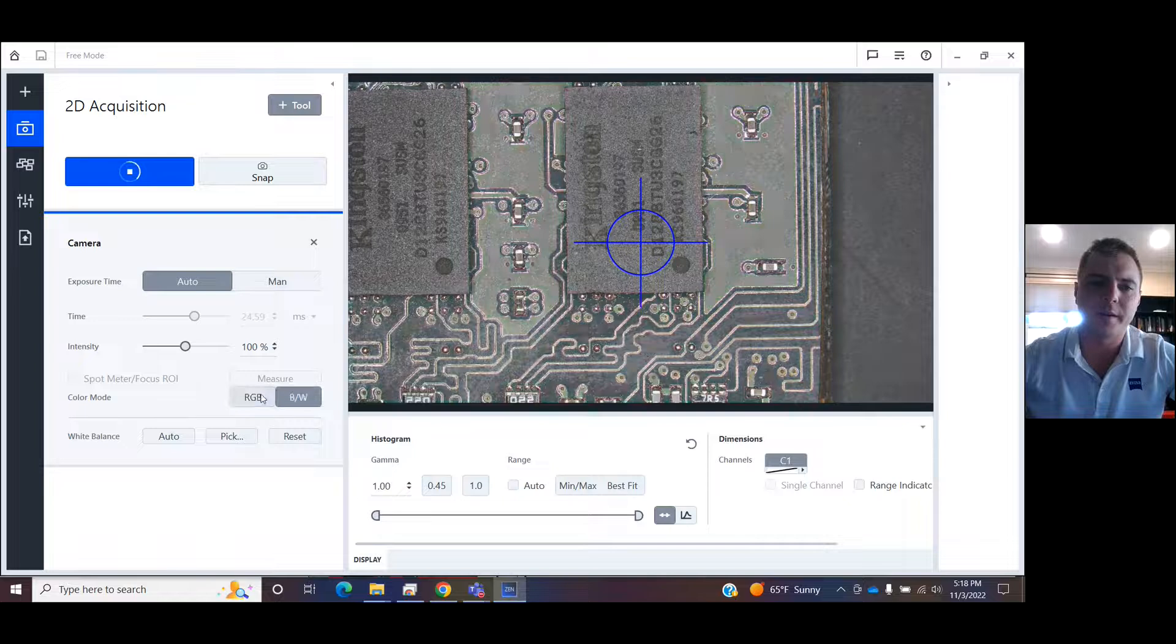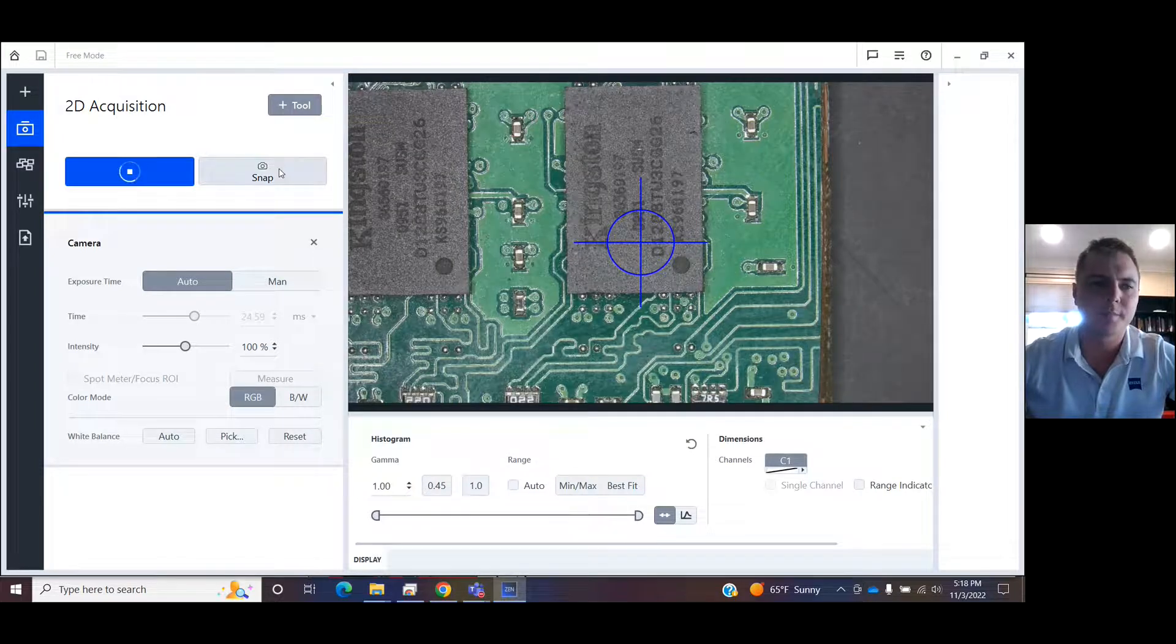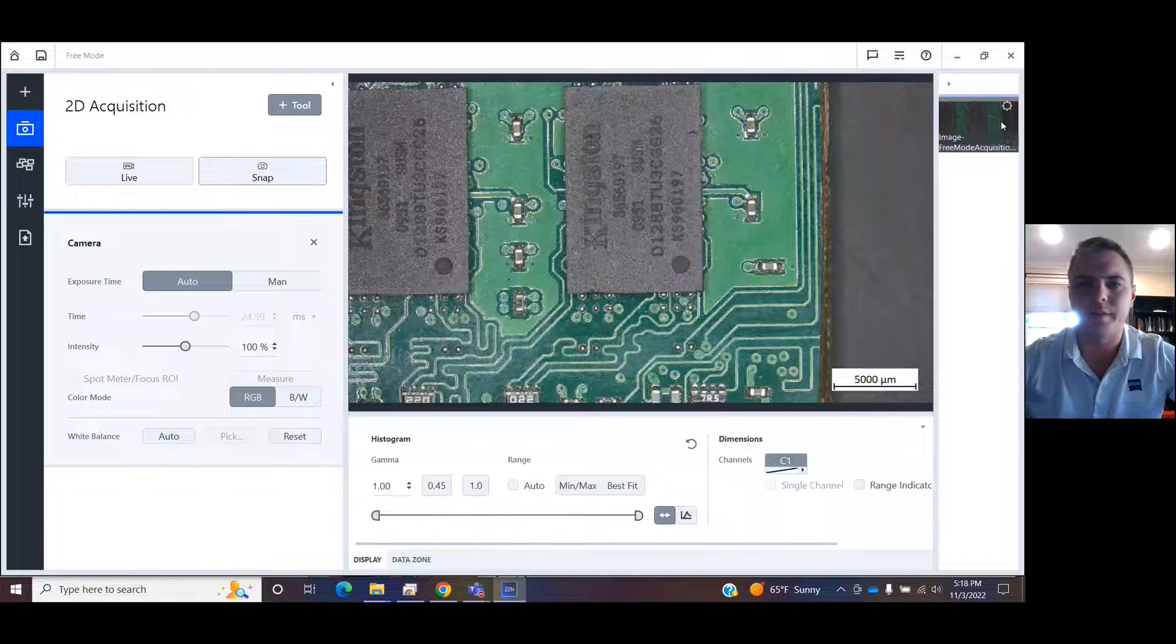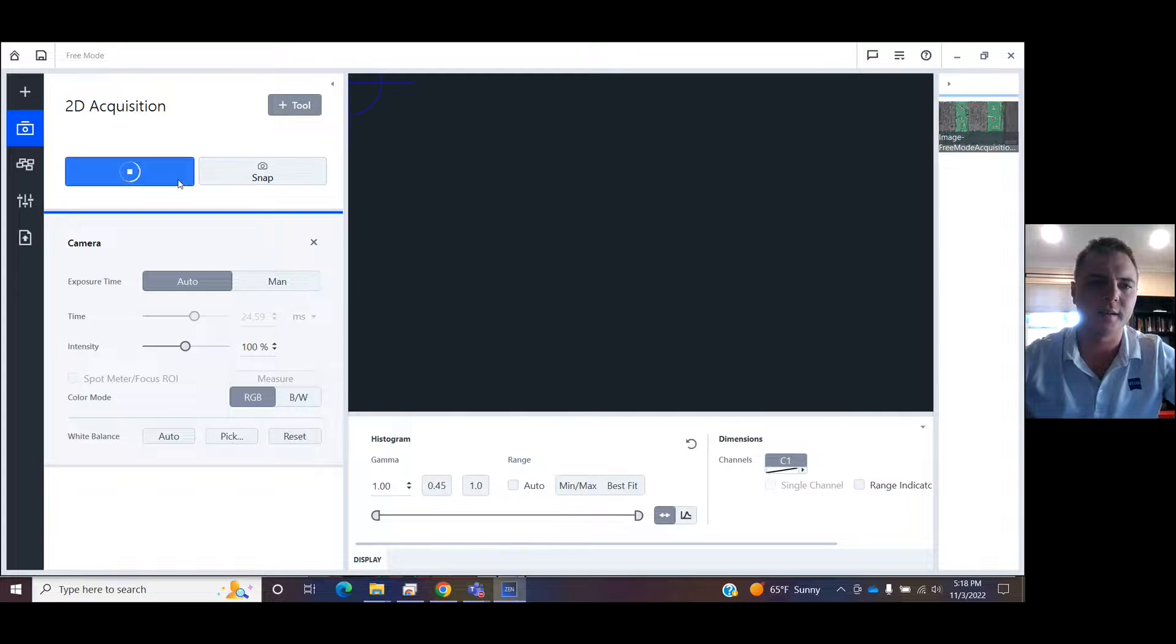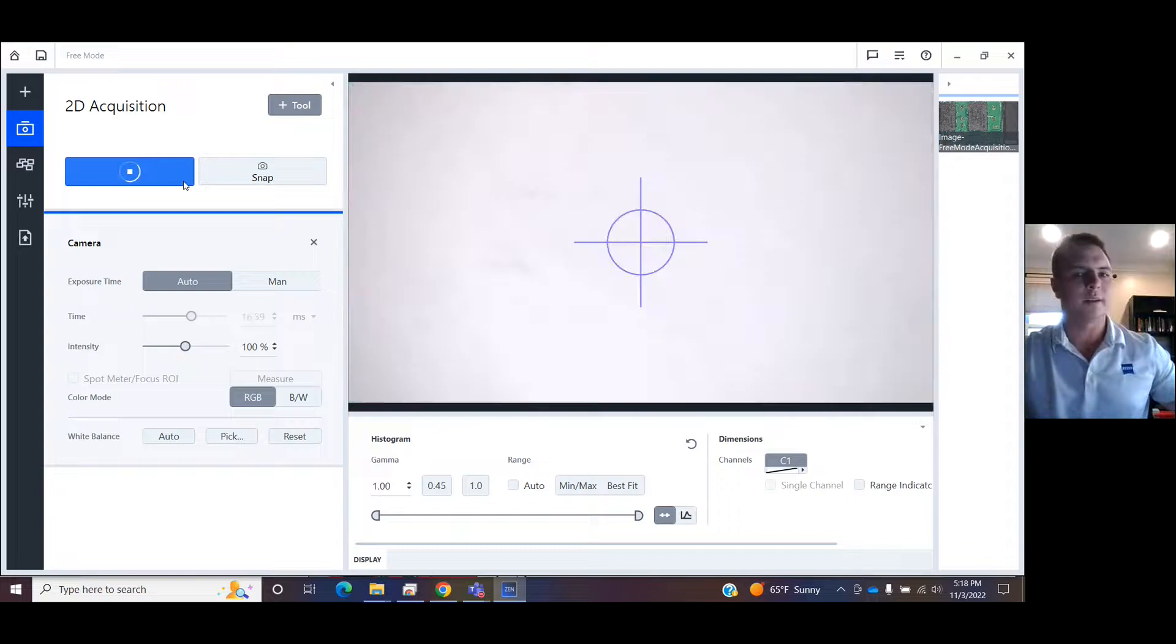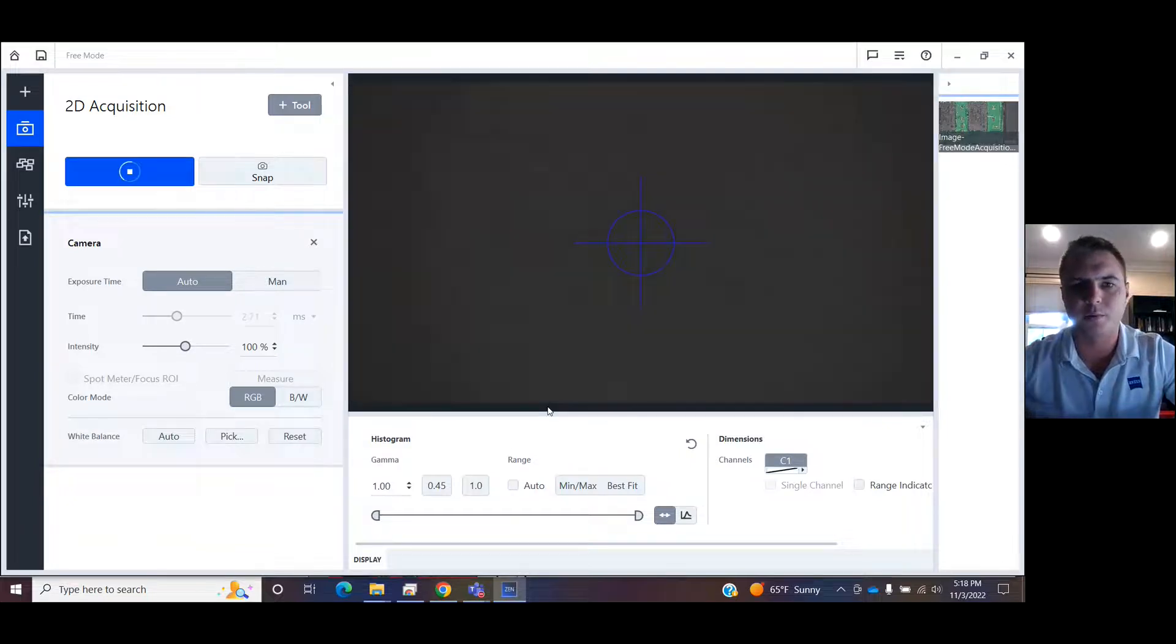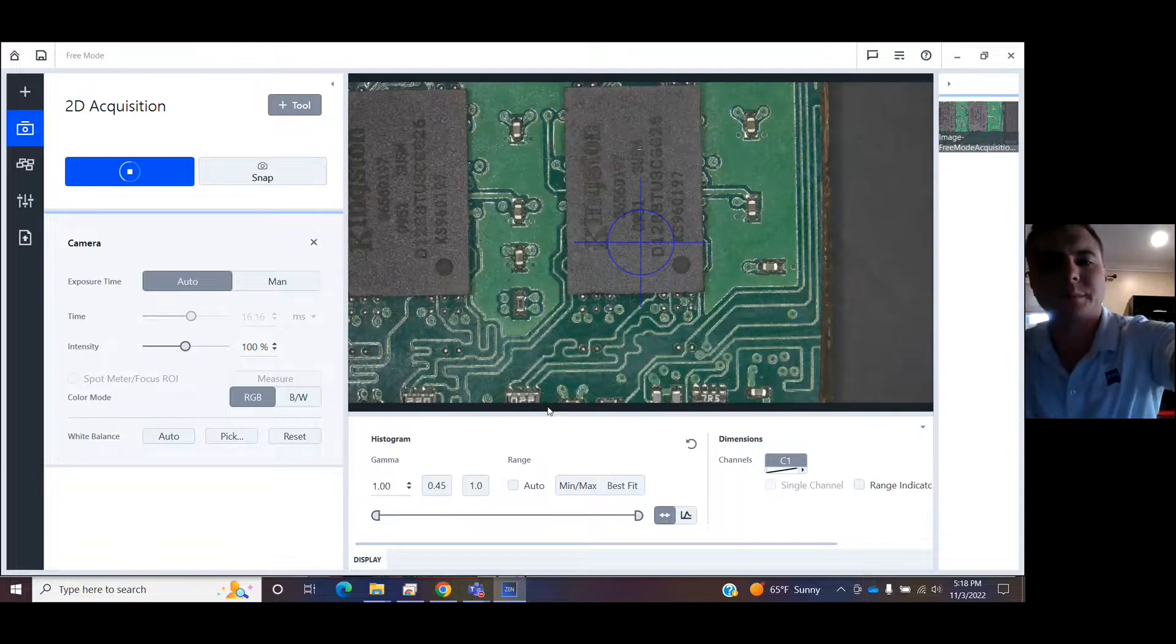Your image in black and white or RGB. You can take a picture right here. Snap. There we go, our picture's right over here on the left. Notice that it's not live right now. I can move my hand underneath it, we can't see anything. Go back to live right here. We want to set a white balance. Something white down like a piece of paper, you can hit pick, just select what you want to tell the camera is white. It will give us true color.